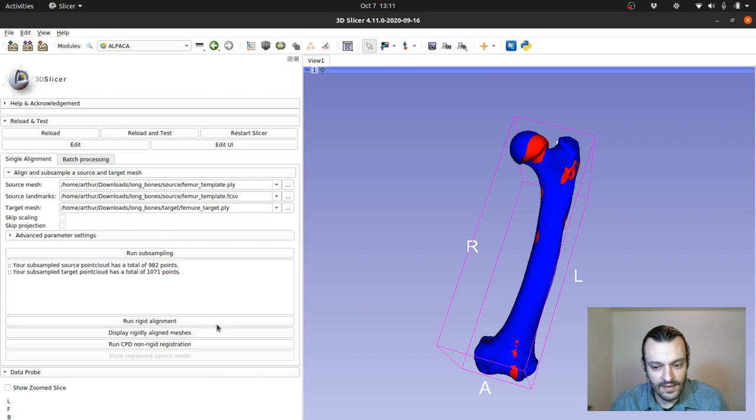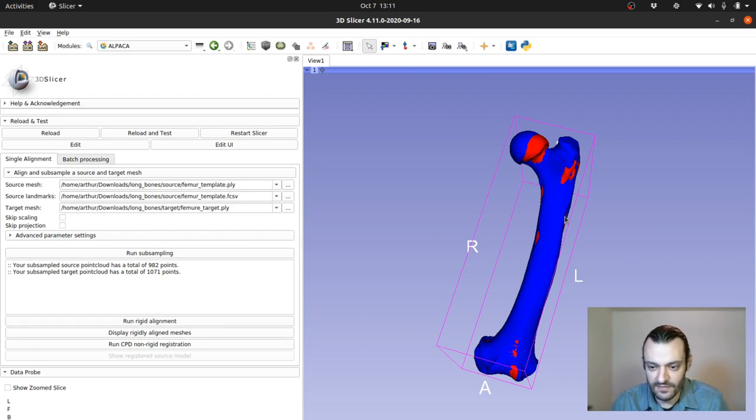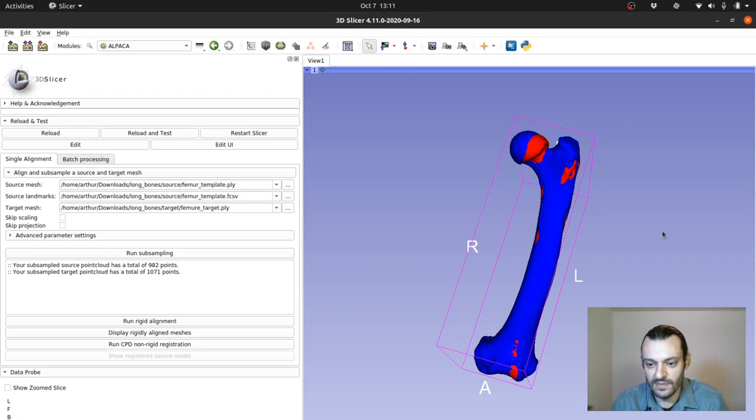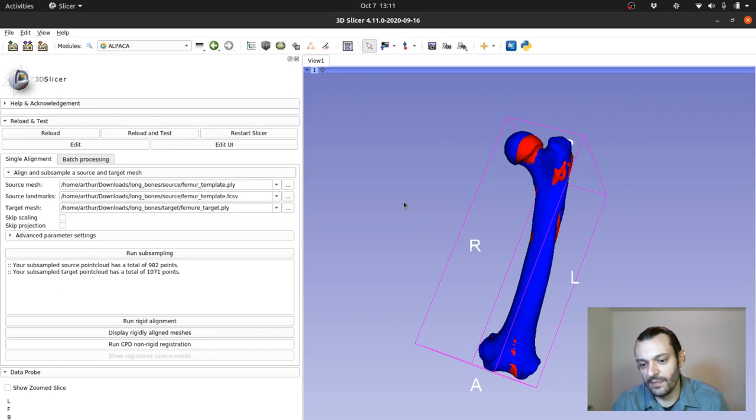And then essentially the next step of the ALPACA pipeline is going to be the deformation. That's pretty much one of the last steps, which is to try to deform this female mesh to match as perfectly as possible the male one. And that actually is the step of the ALPACA pipeline that takes the longest.